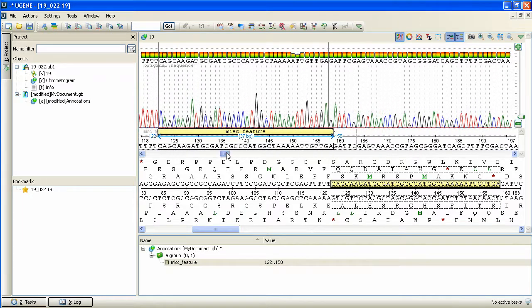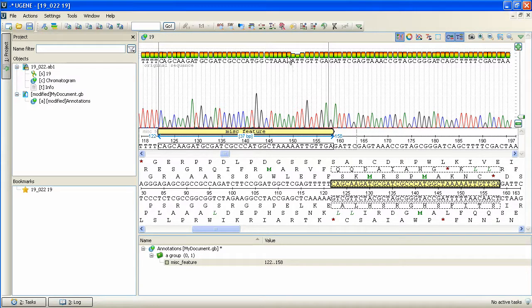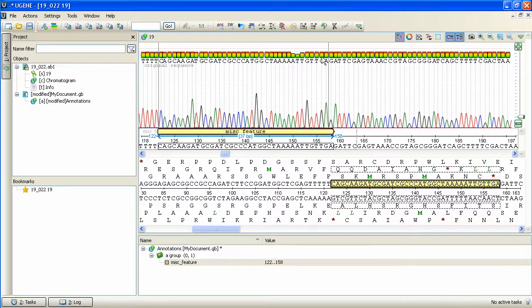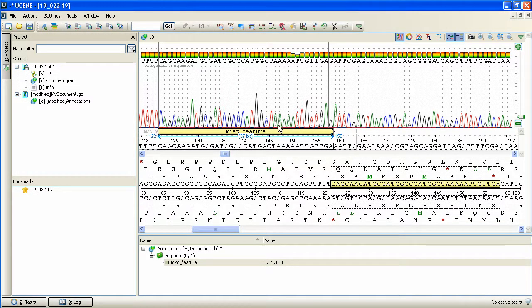Now let's get back to the zoomed chromatogram. The colored rectangles above the base symbols represent the probability of the assumed base symbol to be the actual base. And the colored curves are parts of the chromatogram, representing the value of the input signal for the assumed base.